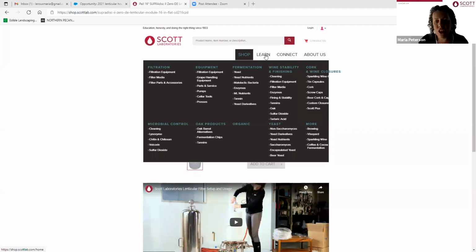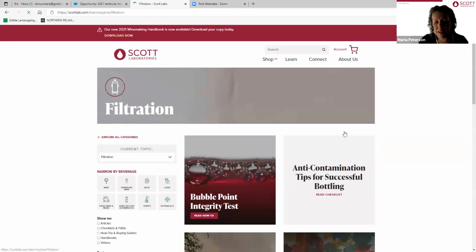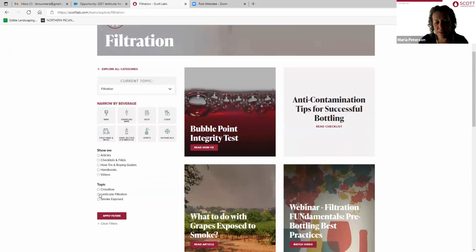Thank you. Where can I access some more detail regarding operating, setup, storage, and regeneration of the media? So I will share my screen. If you look at our website, you'll see we have this learn button here. So filtration, and then you can just look here at topics. Let's just say lenticular and apply filters.